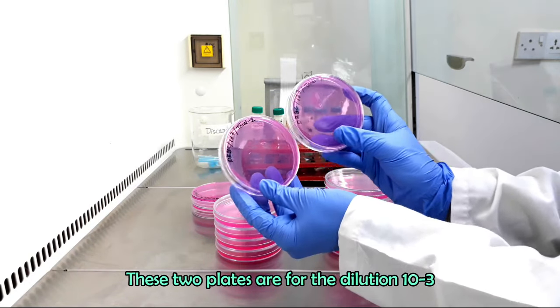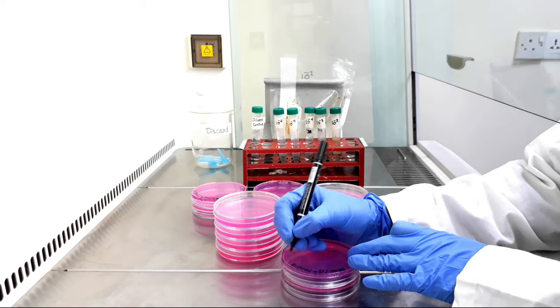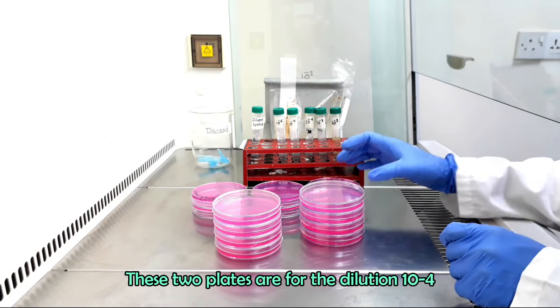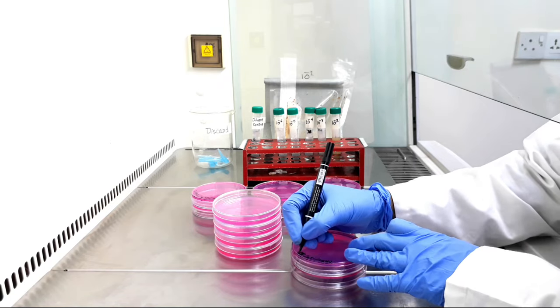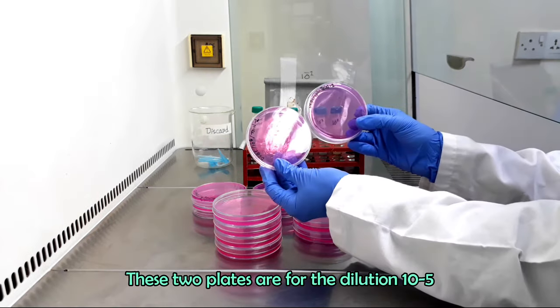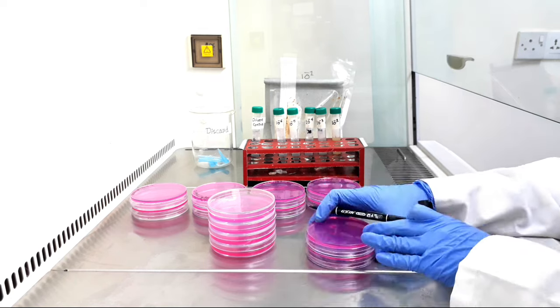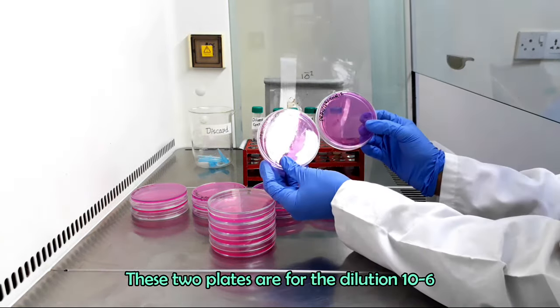These two plates are for the dilution 10 inverse 3. These two plates are for the dilution 10 inverse 4. These two plates are for the dilution 10 inverse 5. And these two plates are for the dilution 10 inverse 6.